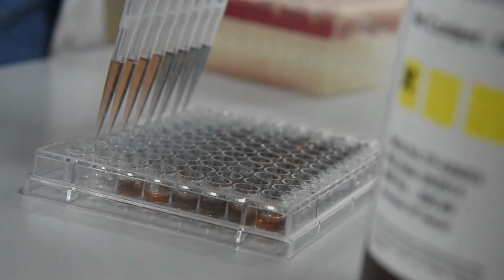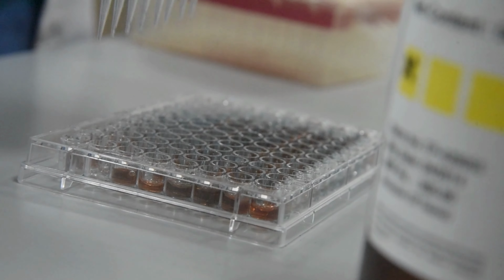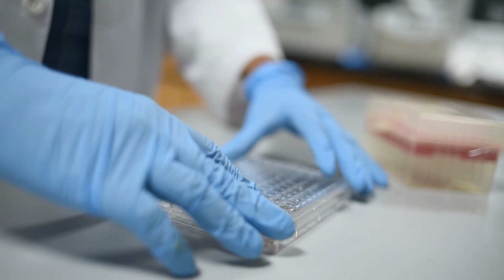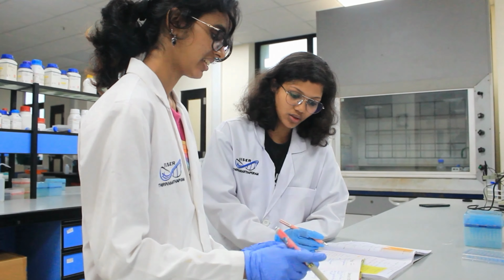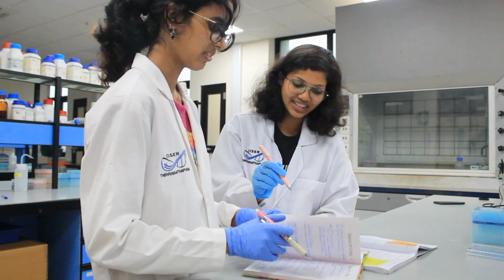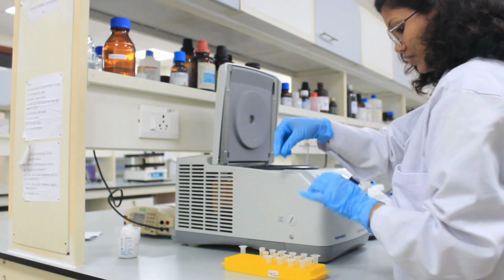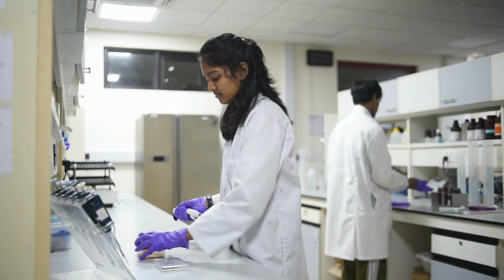An organized biowaste management system relies on the effectiveness of primary sort that happens within the research labs. Being a research facility with multitudes of labs generating tons of waste each day, a student community who is well aware of the segregation procedures is quite essential. To know more about the initiatives put forth by the Institute in this regard, we interviewed Dr. Poonam Thakur, Biosafety Officer in charge for School of Biology Labs.